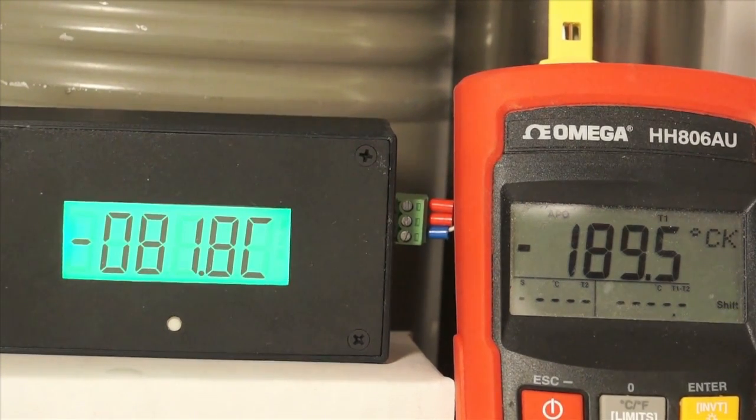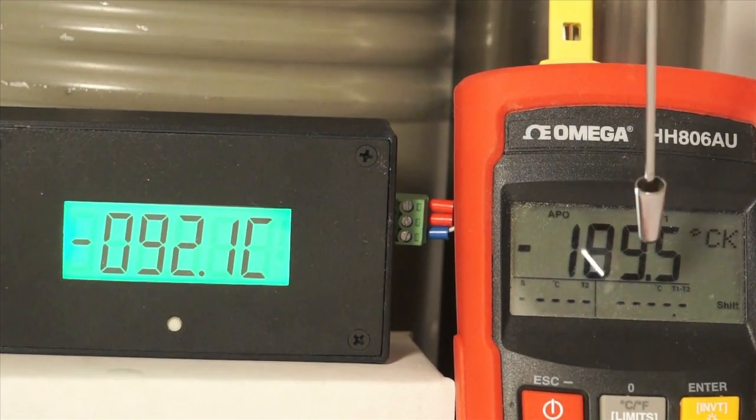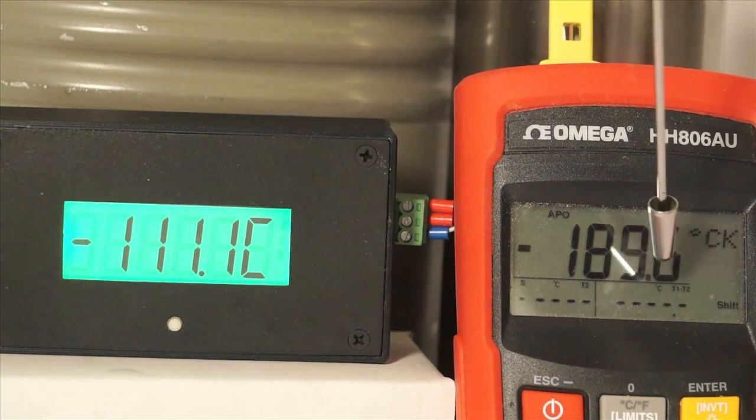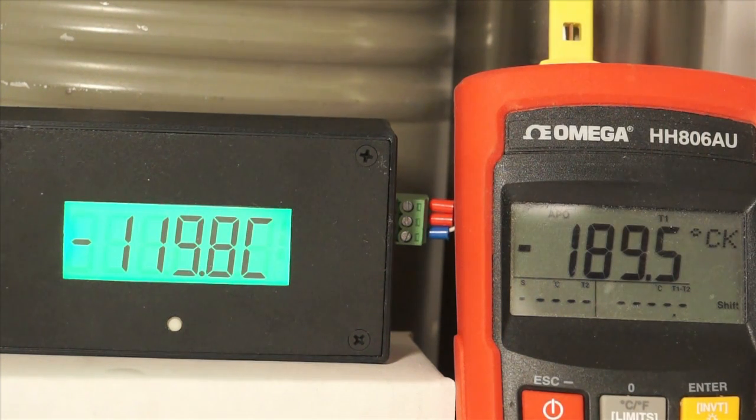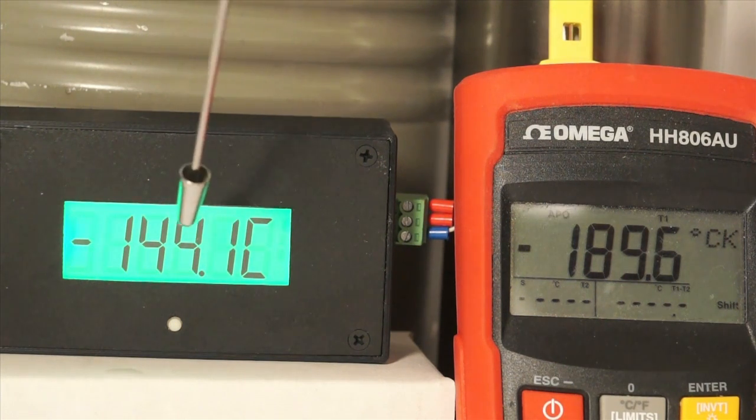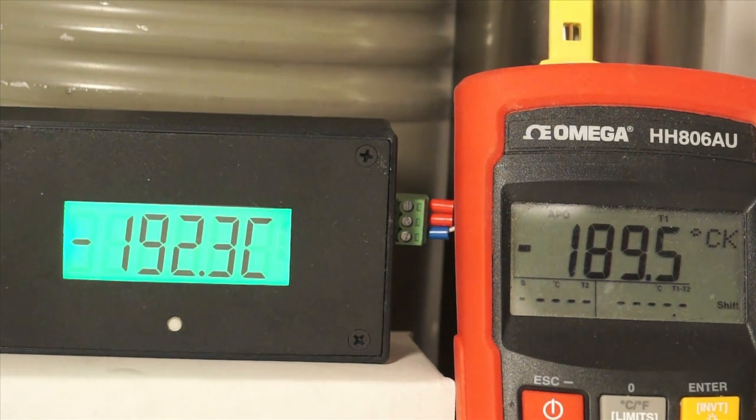You'll notice that the Omega settles at a temperature of about minus 189 centigrade. The Crybaby will rapidly approach its true temperature of minus 195.